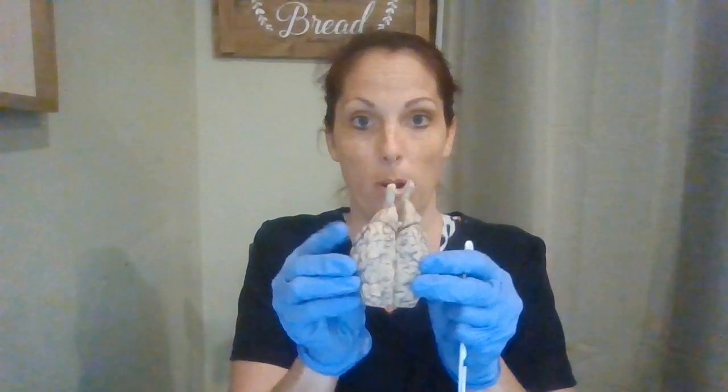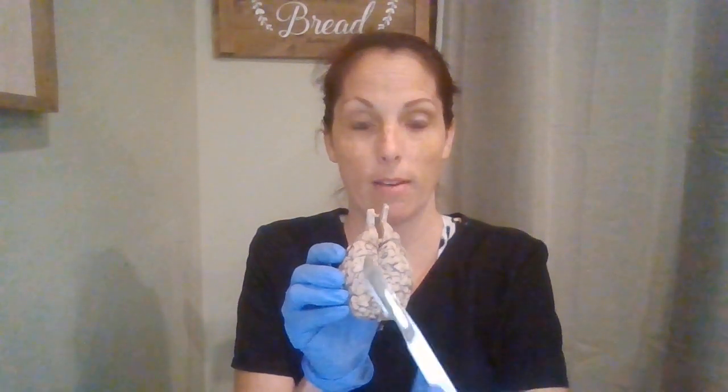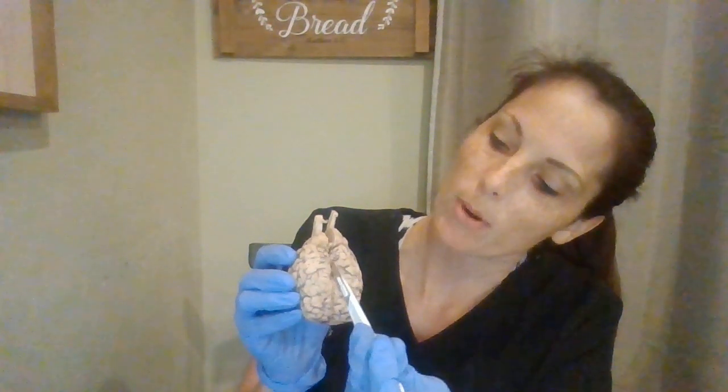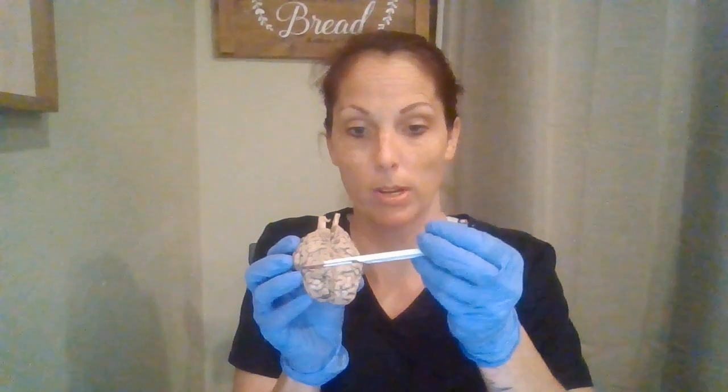I did forget to mention that when you have the full sheep brain, you have the right and the left hemispheres of the brain, which is separated by that longitudinal fissure there. So I am going to cut my coronal cut, like I said, which is going to be about right in there. I'll go ahead and do that.